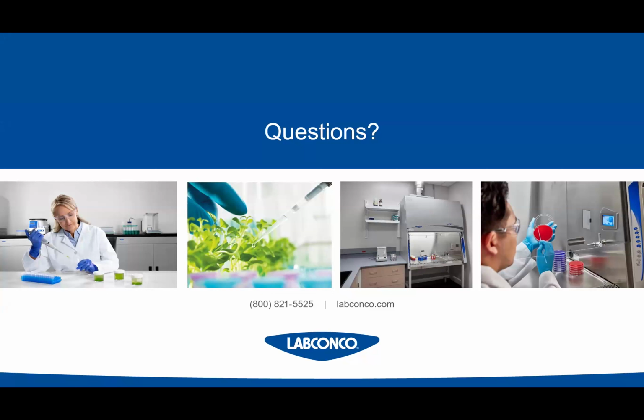All of our HEPA filters on all of these enclosures I talked about, especially biosafety cabinets, need to be 100% leak tight. So part of the annual certification that's recommended, they take literally a probe across every inch of that HEPA filter, make sure there's no leaks. You go around it. These enclosures, most of them are designed with a negative pressure plenum. So if something does happen to the plenum, it's going to get sucked back in. But again, usually certification companies that have the equipment to do those helium leak tests or the particulate leak tests on the HEPA filters are changing these HEPAs. I would definitely recommend that.